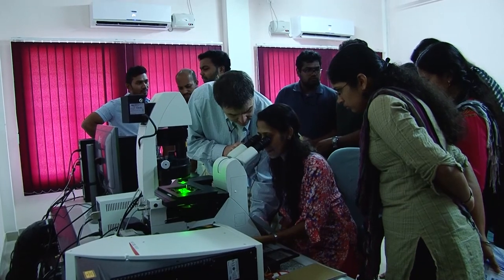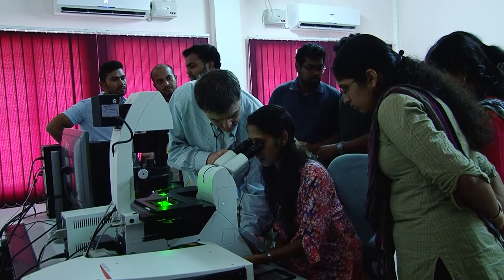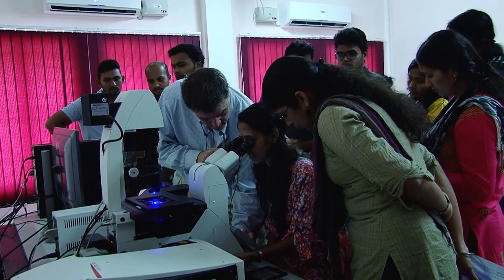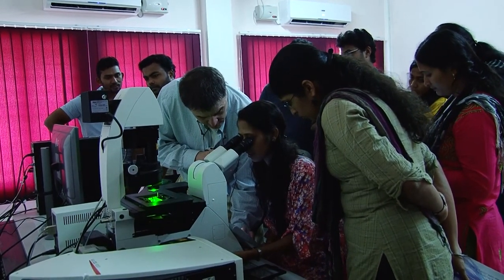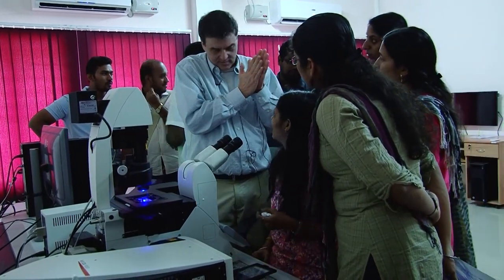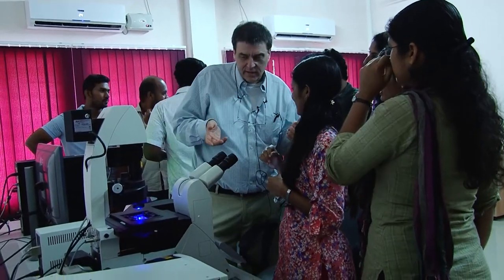See how it looks the same? Does it look pretty much the same? Pretty close? But I can differentiate. But it's close, right? Yes. Right. Because the problem is both your excitations are like, they're on top of each other. Yeah. That's all right. That's why you're here, to learn these things, okay?